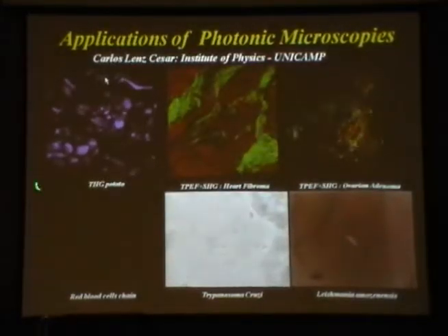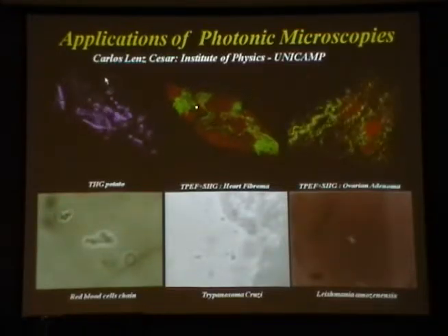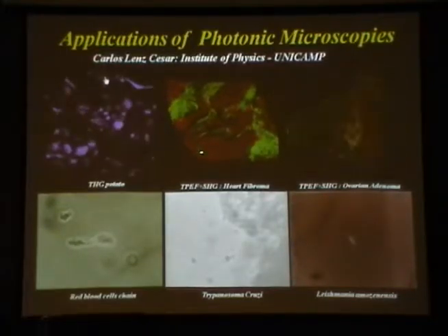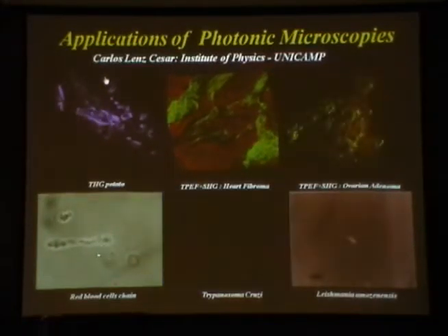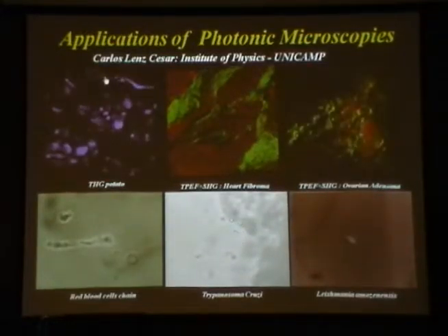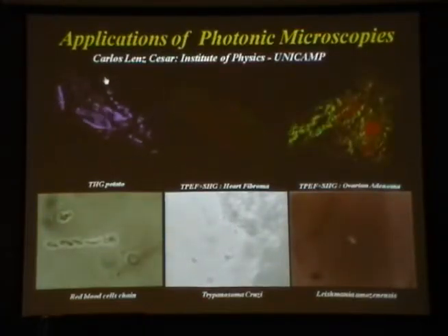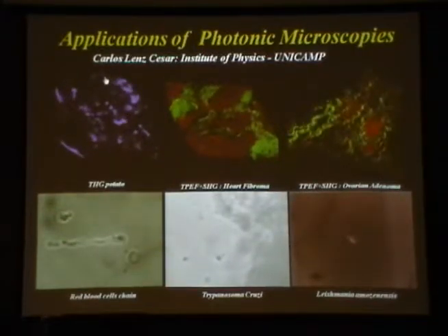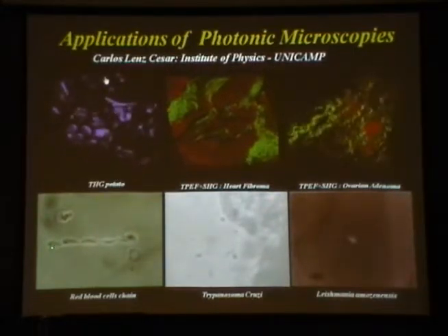Here I have the THG image of potatoes. Here we have second harmonic generation, this is the green one, and the fluorescence of hematoxylin in a fibroma. Here we have an ovarian adenoma with second harmonic. That's our optical tweezer working here. That's a trypanosoma cruzi. It's close to the wall of the intestine of the insect, and you see it can try to bond to the wall there. This guy here is quite unhappy. It's trapped in the optical tweezer. It's trying to escape.